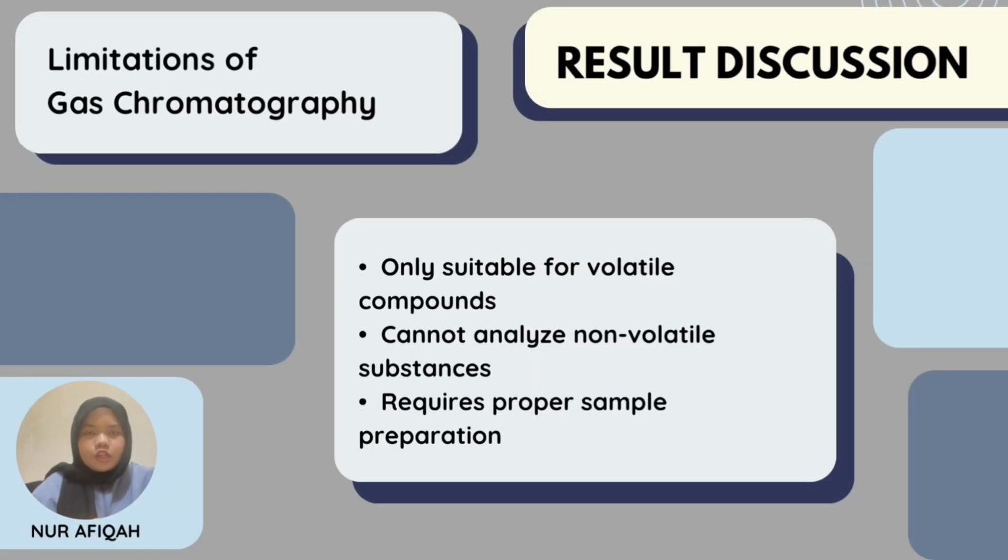Next, we move to the limitations of gas chromatography. Despite its advantages, gas chromatography has some limitations. It is only suitable for volatile compounds and cannot analyze non-volatile substances. Gas chromatography analysis also requires proper sample preparation to obtain accurate results.